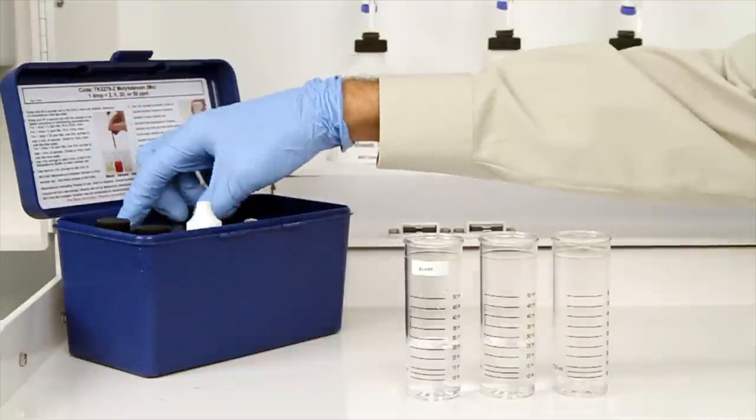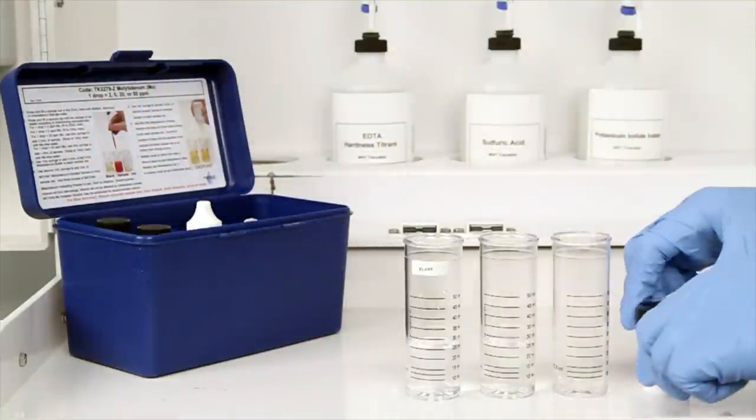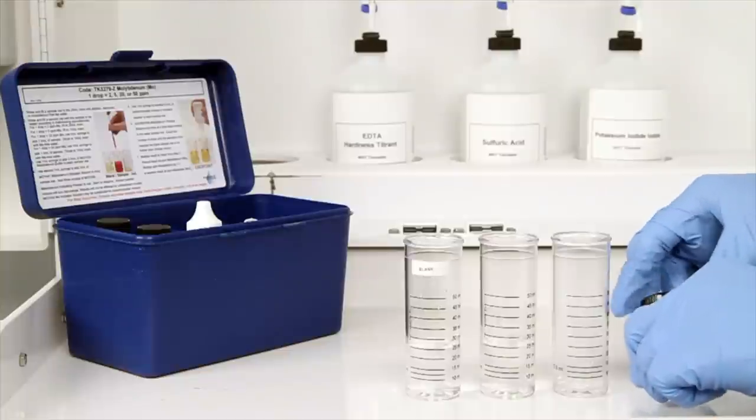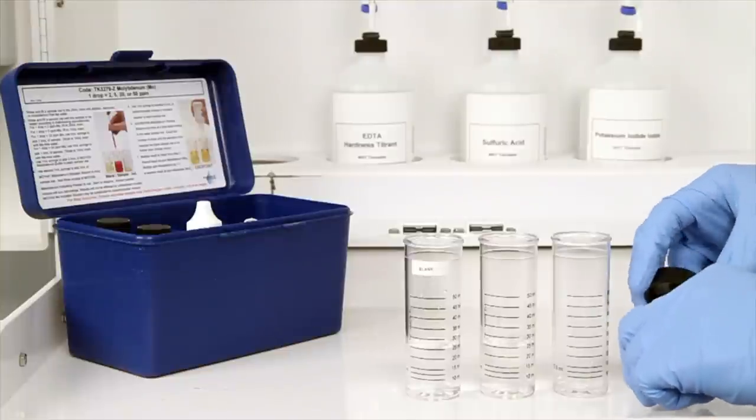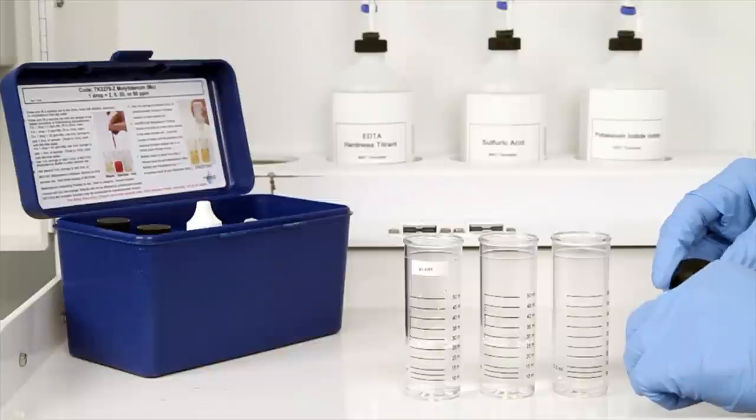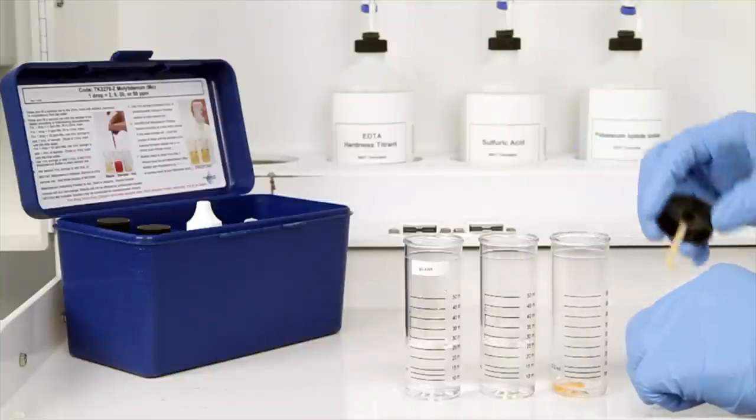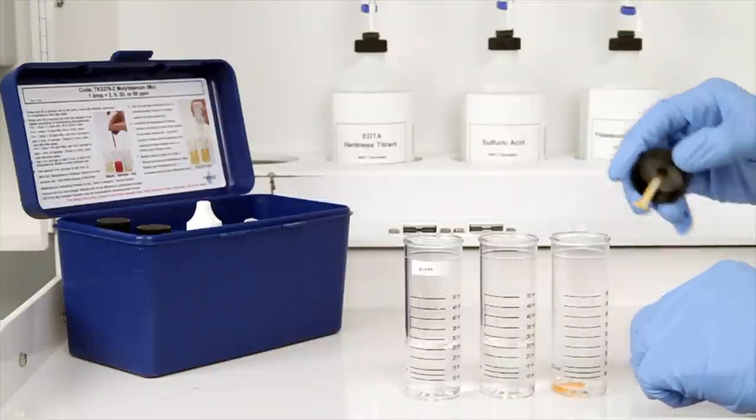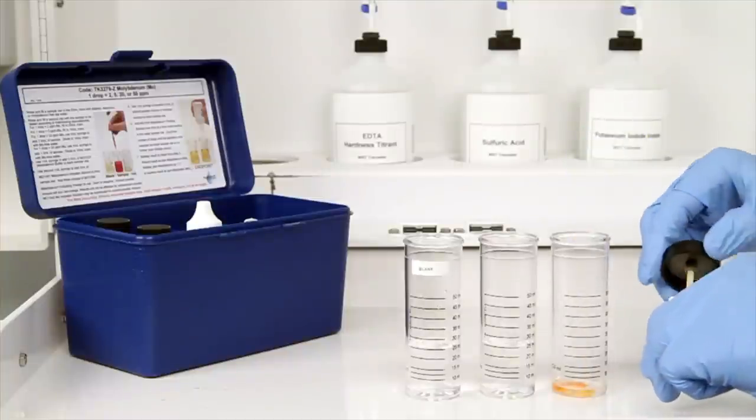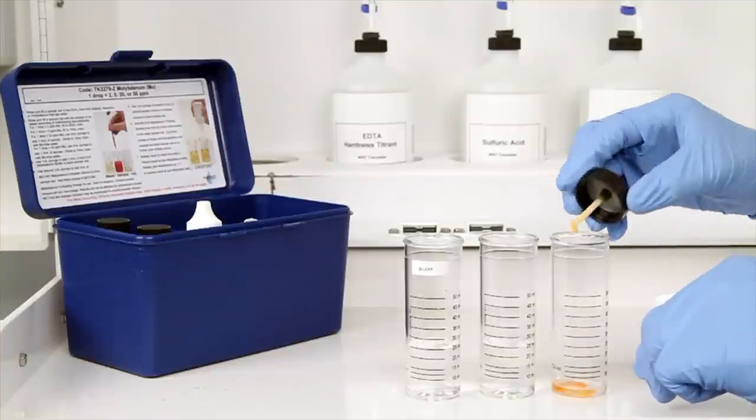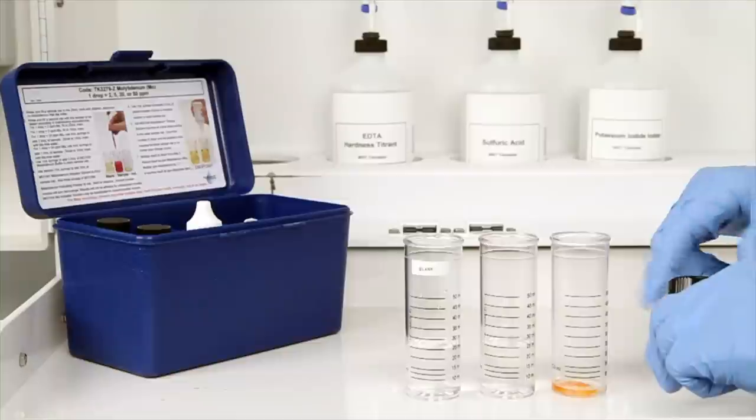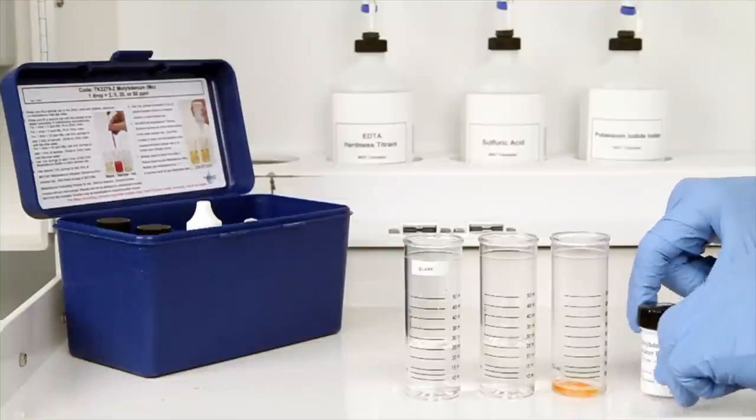Then, add three scoops of molybdenum indicating powder to the third vial and swirl to dissolve. The solvent powder mixture will turn a red-orange color. Your results will not be affected by undissolved crystals.